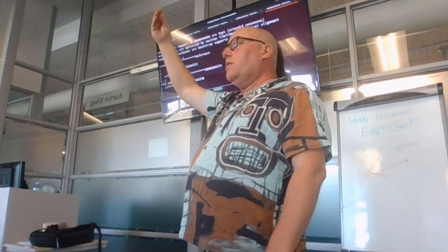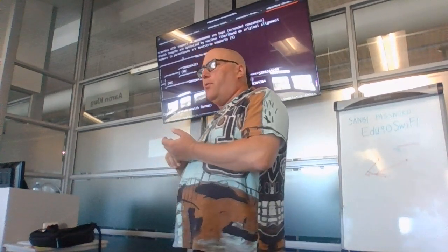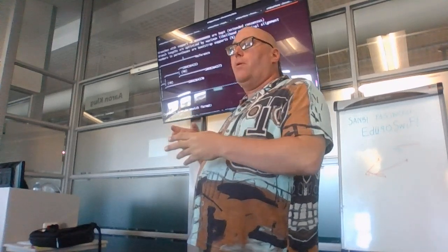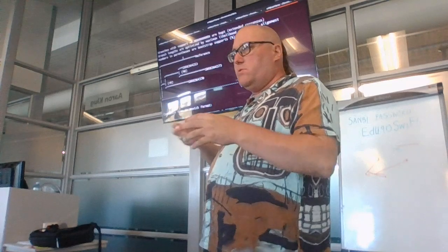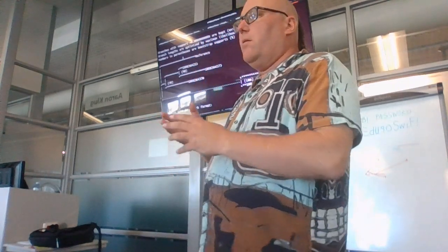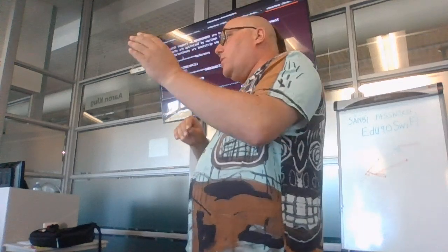But you raise a good question, which is that if you choose something in the middle of a tree and you make that the outgroup, then imagine that you have a sample, and this sample has variants that are in common with many of your other samples, then it will confuse the program in terms of how to organize the tree, because now it won't know, is this going this way or that way.